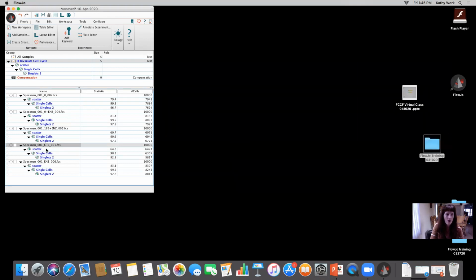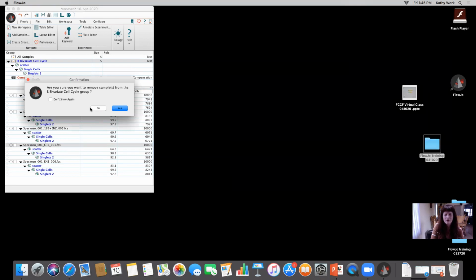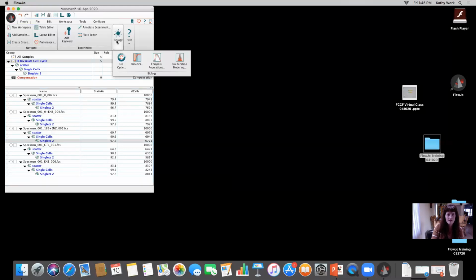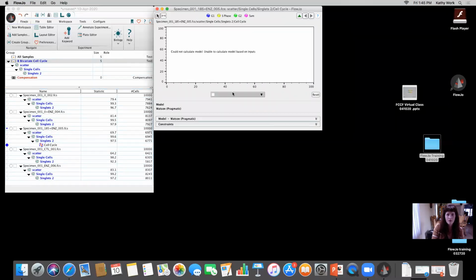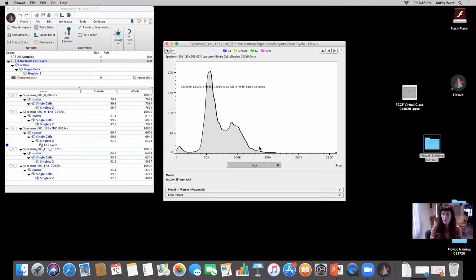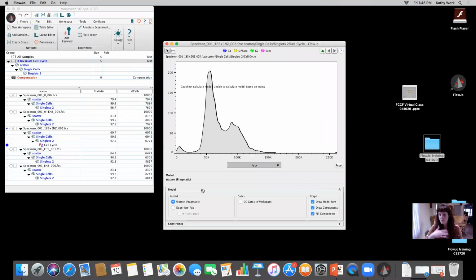Close all of that. I'm actually going to delete this control. Actually, I'm not. Take that back. Okay. What I'm going to do is I'm going to take a look at the cell cycle there. Okay. I'm going to look at the PI. It's not looking that wonderful. Now, by not wonderful, it's not showing me any modeling, right? I can come in, I can put in a constraint, and I can set that as G1, right?